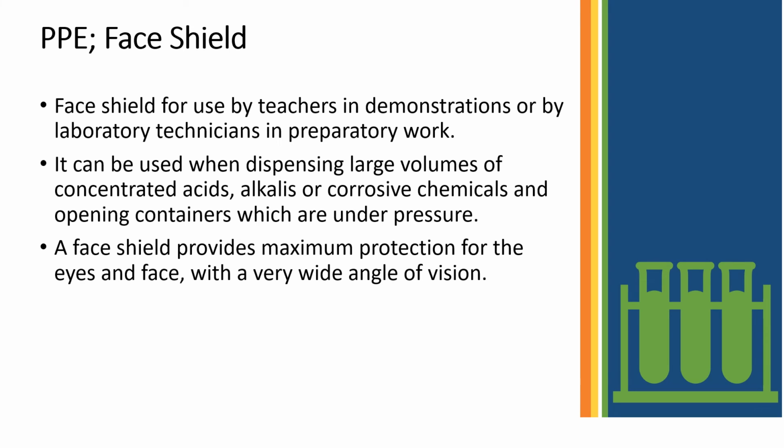PPE: face shield. Face shields are for use by teachers in demonstrations or by laboratory technicians in preparatory work. It can be used when dispensing large volumes of concentrated acids, alkalis, or corrosive chemicals and opening containers which are under pressure. A face shield provides maximum protection for the eyes and face with a very wide angle of vision.